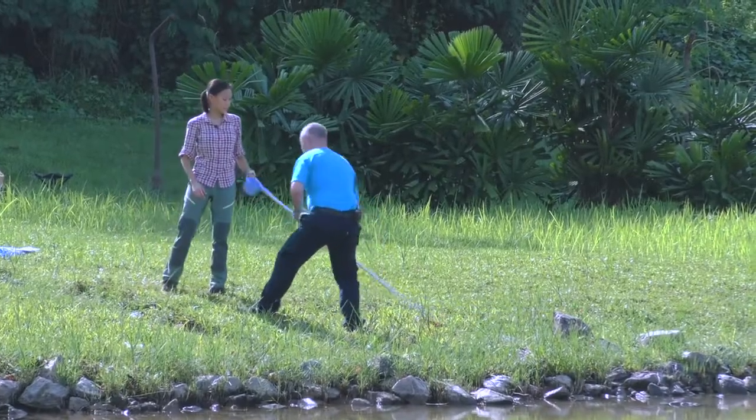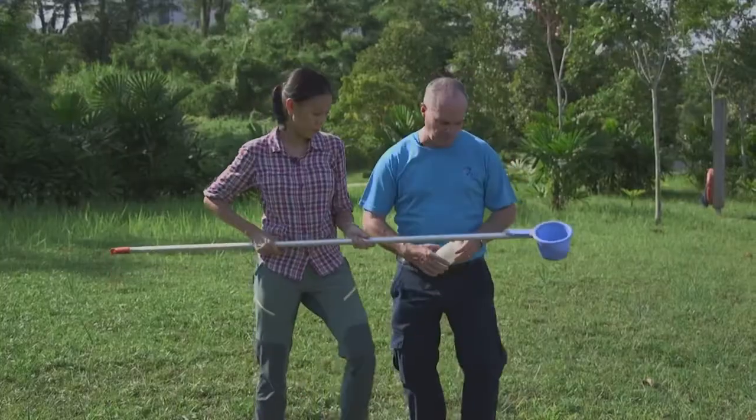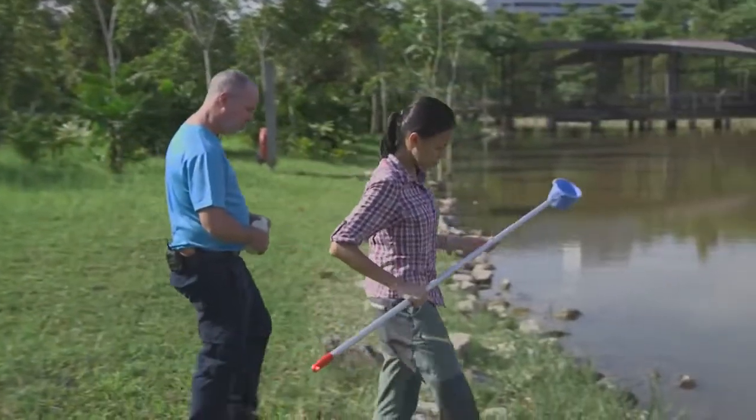Sure, Prof. Let's start by looking at manual grab sample collection. There are different instruments that can be employed for this type of sampling. The simplest is a homemade dipper, as we can see here. With the dipper, we can take our sample from the shoreline or from a bridge, and we will be collecting the surface water. Because you may not know where the dipper has been, it is best to rinse it 3 times before you collect the actual sample.